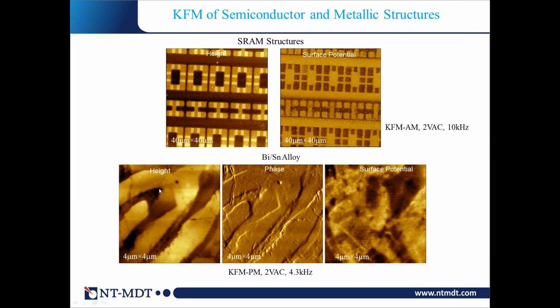But as I will also show, even on metal samples where the difference of work function is reflected in surface potential images, you can do the job, you can do compositional mapping if you want. The trick is that compositional mapping with phase imaging and with mechanical and adhesive properties is mostly related to studies of soft materials with modulus less than, let's say, 10.7 gigapascal.